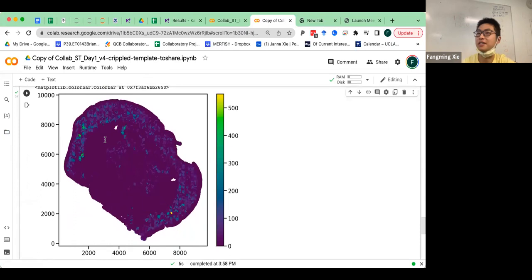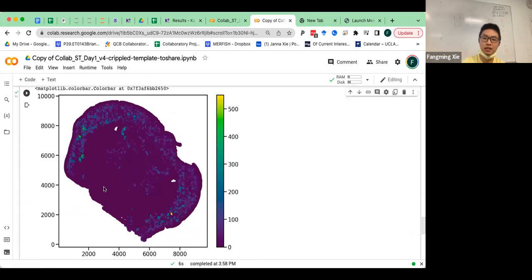It looks like a brain, vaguely, but it's very crowded. And with a color bar, everything goes from 0 to 500 for that gene. Okay, that's our first step, applying a scatter plot to real data. So you do see X and Y coordinates, you see individual cells represented by dots, and dots are colored by different colors representing gene expression level. But the problem is, what's the problem?